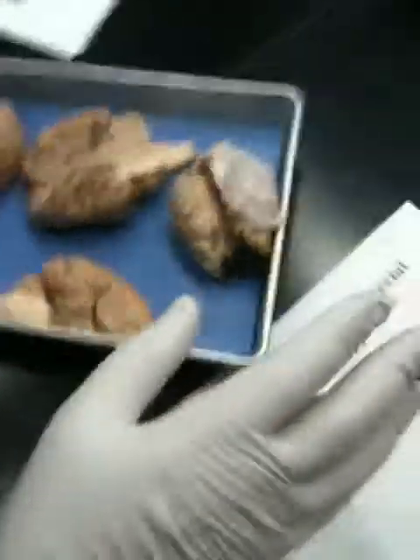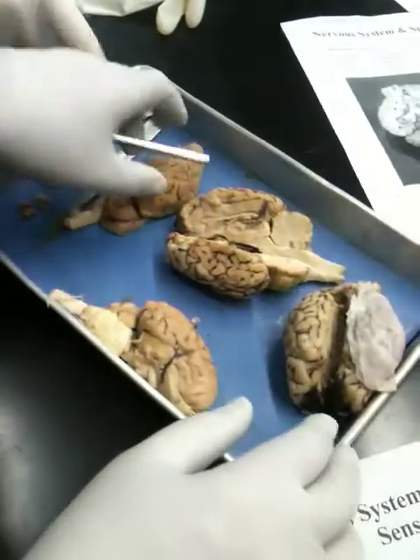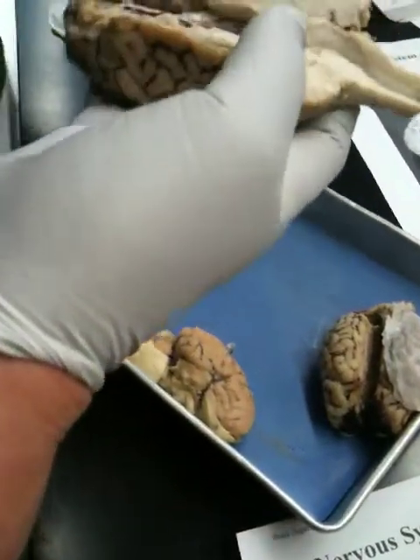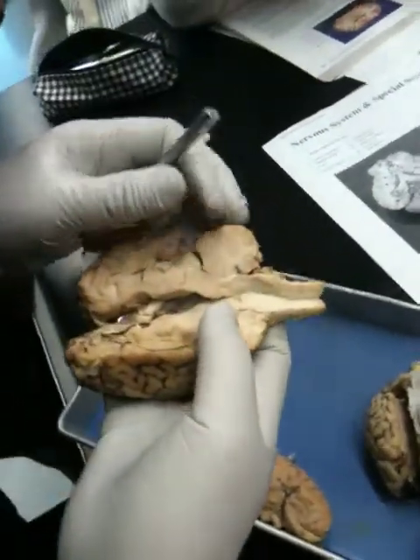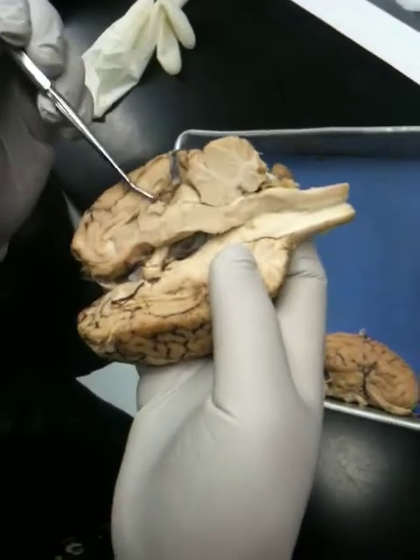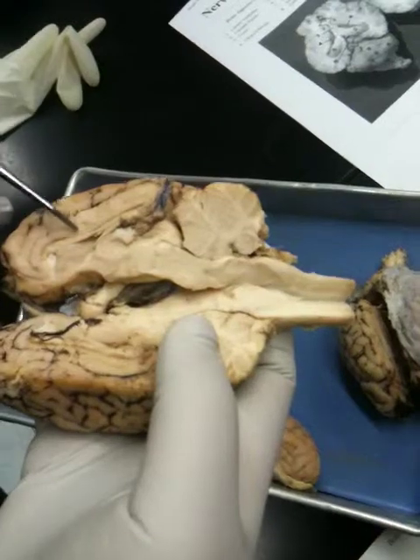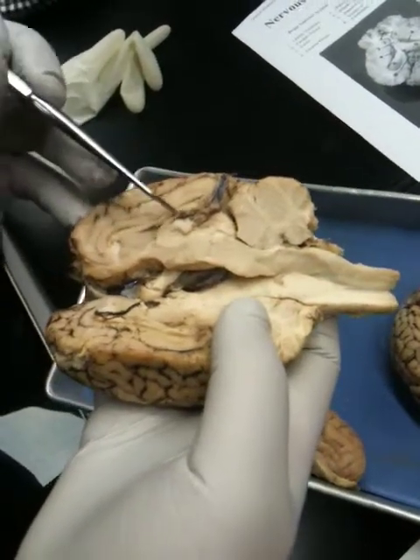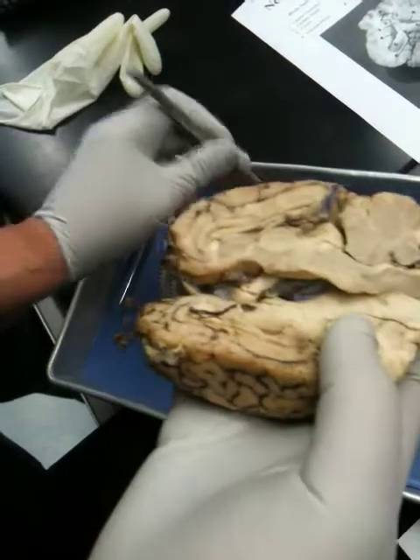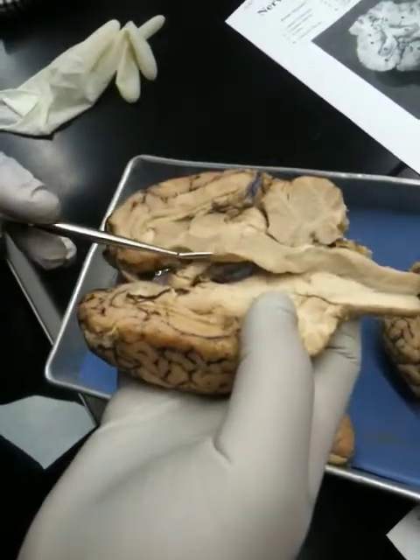Now let's look at yours. Which one did you do? We did this one and this one, and I think this is yours together. See the part of the choroid plexus there? That's the blood vessels. Here's the pineal body, the corpus callosum on top and the fornix on the bottom. This is the hypothalamus.